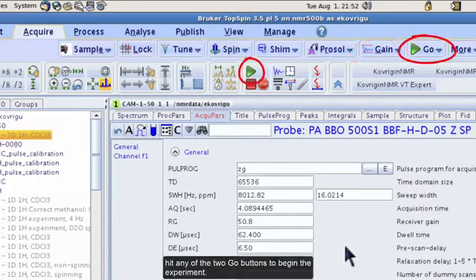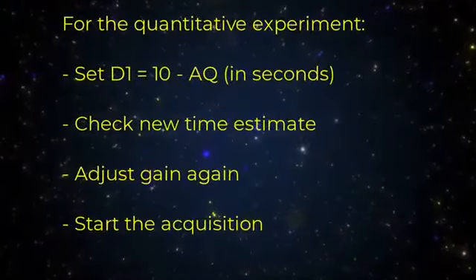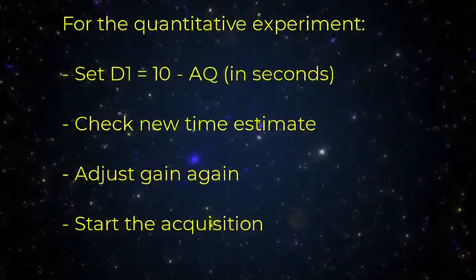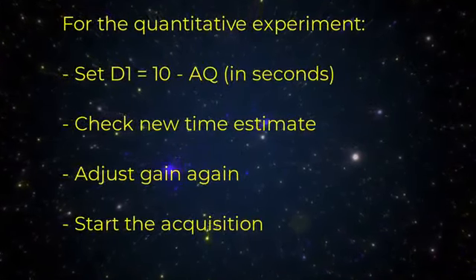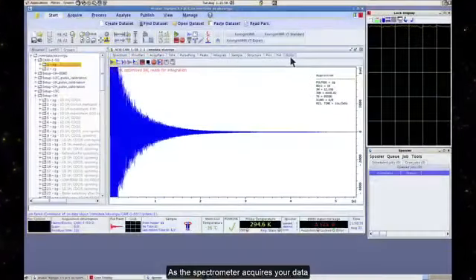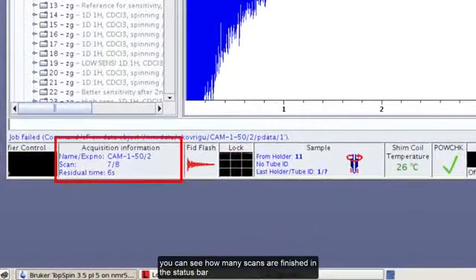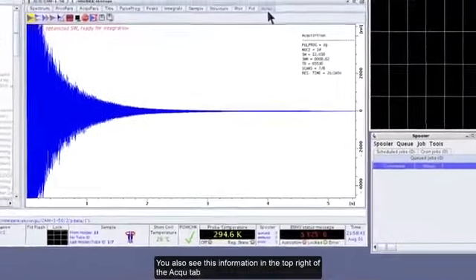A high Q factor indicates a sharp resonance, which leads to higher sensitivity and better signal-to-noise ratio. A low Q factor indicates a broad resonance, which is less sensitive but can handle a wider range of frequencies, useful for broadband observe probes. Cryoprobes have an extremely high Q factor, which is a major source of their enhanced sensitivity.